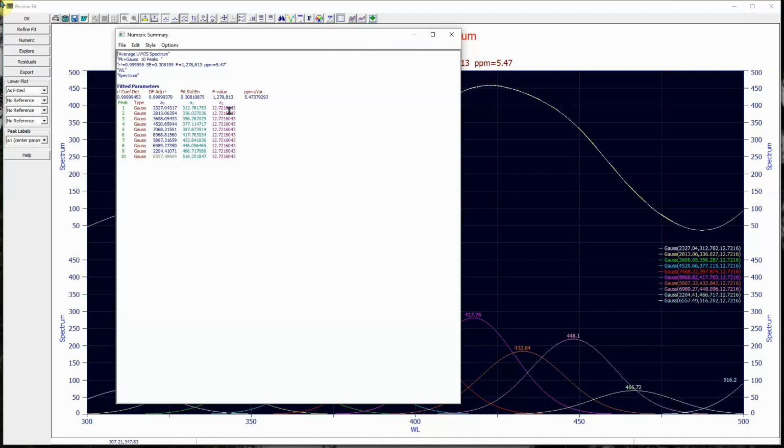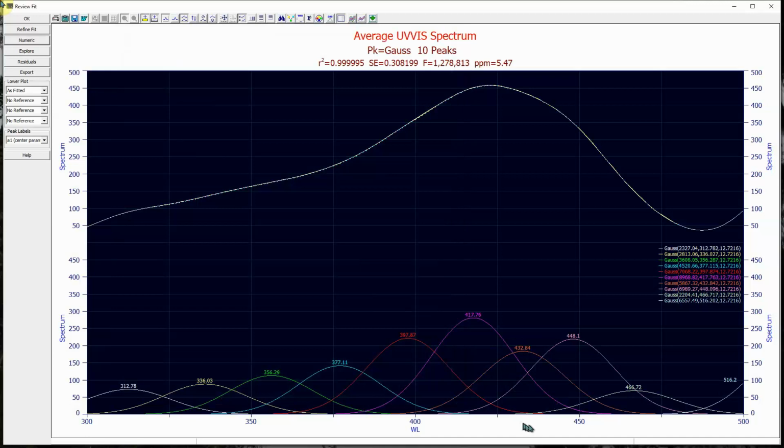Now, when you do this type of analysis, you may not see the actual absorbances of the materials in the specific solvent if there are multiple components and overlapping absorbances, but you will see the wavelengths that can be seen by the modeling. It's a meaningful picture of the wavelengths the spectral modeling will be able to find. If we are looking for a peak in the 425 to 450 band, as we are in this case, the largest peak is at 448, and the smaller one is at 433.